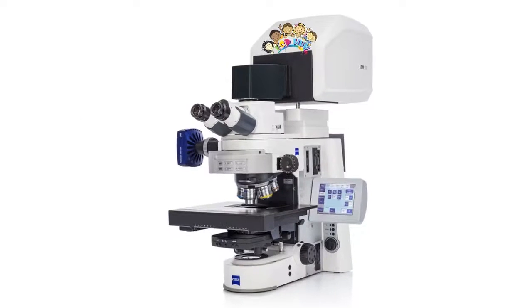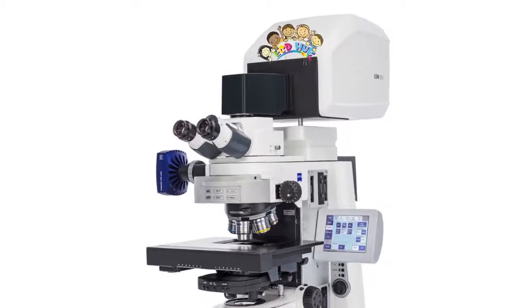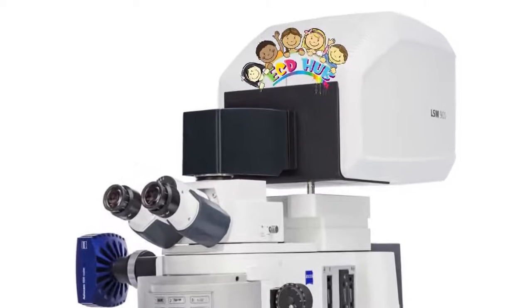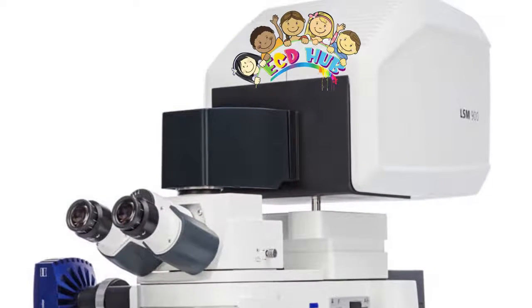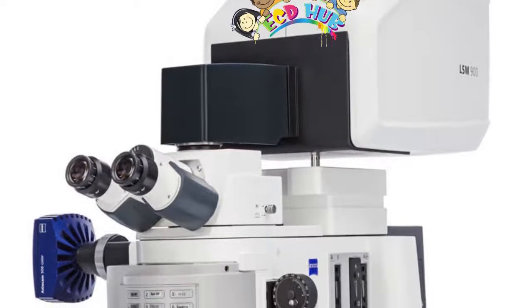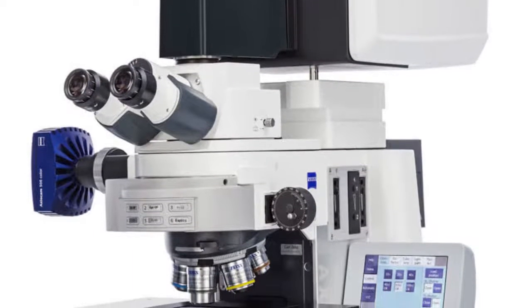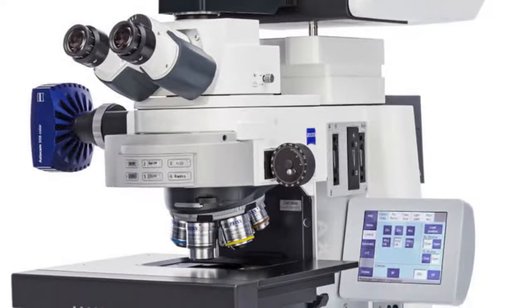Unlike stereo and compound microscopes, which use regular light for image formation, the confocal microscope uses a laser light to scan samples that have been dyed. These samples are prepared on slides and inserted. Then, with the aid of a dichromatic mirror, the device produces a magnified image on a computer screen.